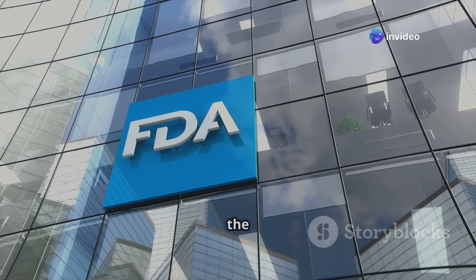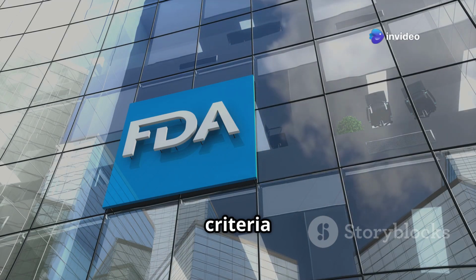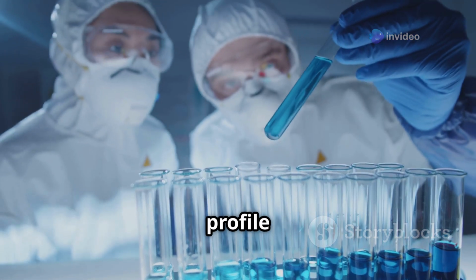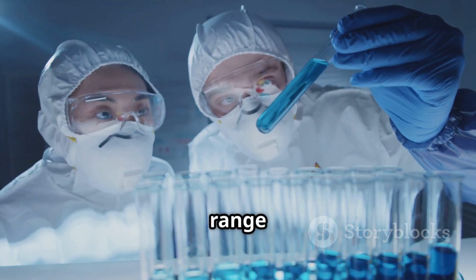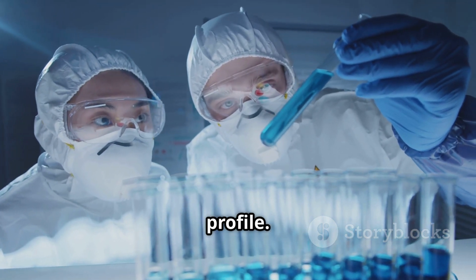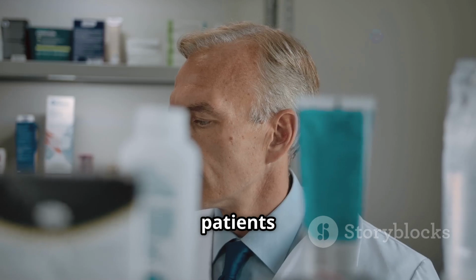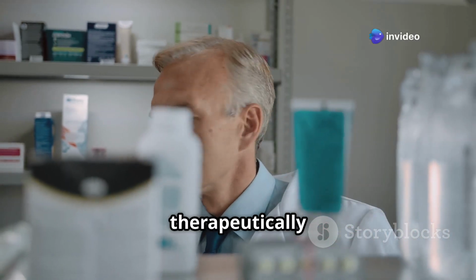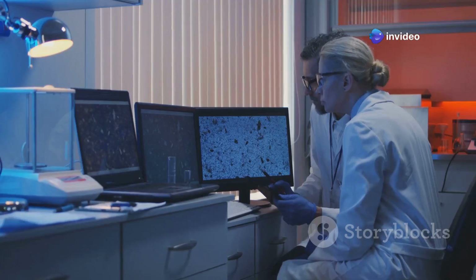Regulatory agencies such as the FDA set strict criteria for bioequivalence, requiring the generic drug's dissolution profile to fall within a specific range of the brand name drug's profile. This ensures that patients switching to generic versions can be confident they are receiving a therapeutically equivalent medication.